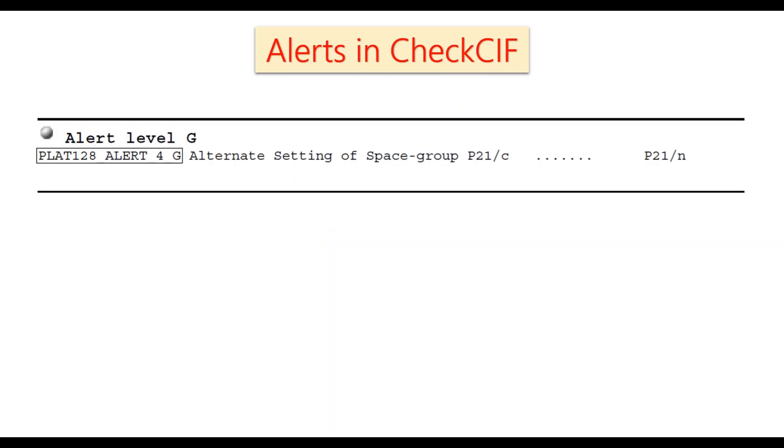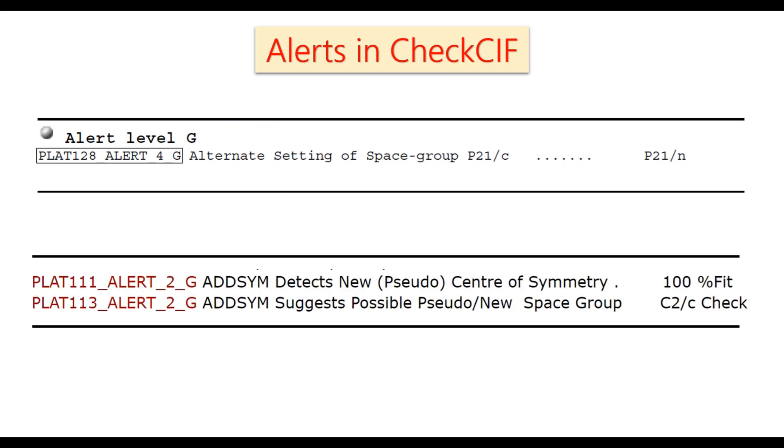Sometimes we are getting some alert in CheckCIF. One alert is alternate setting of space group P21/c, P21/n. And the second alert is getting like this: AdSym detects new pseudo center of symmetry or AdSym suggests possible pseudo new space group C2/c.